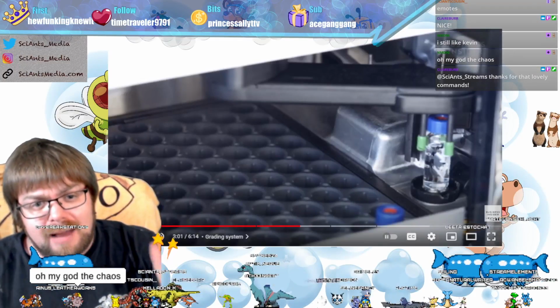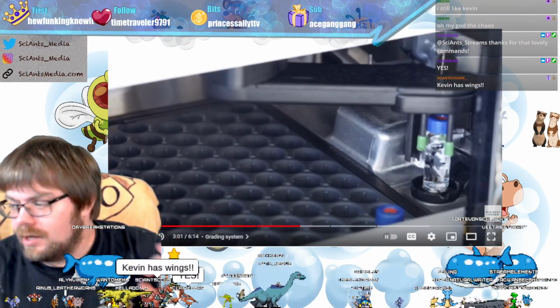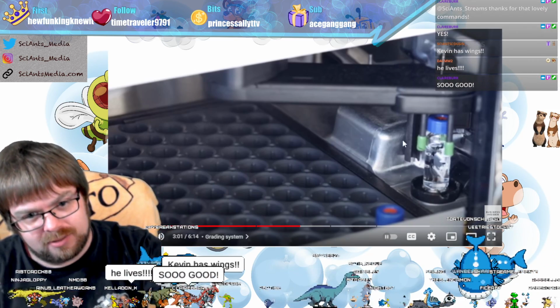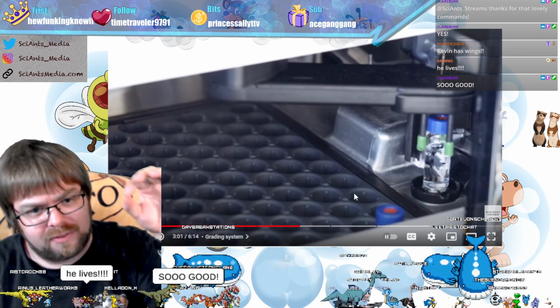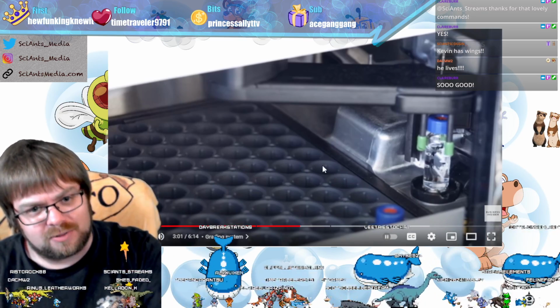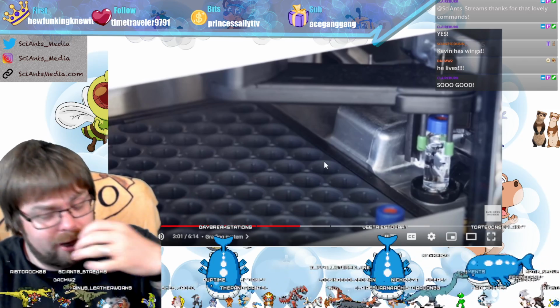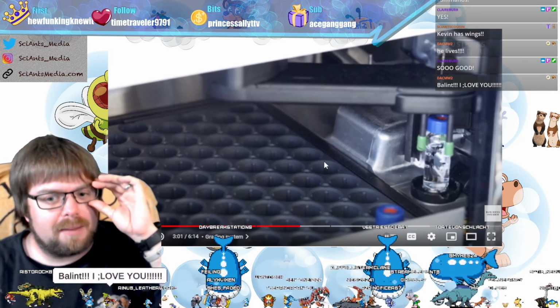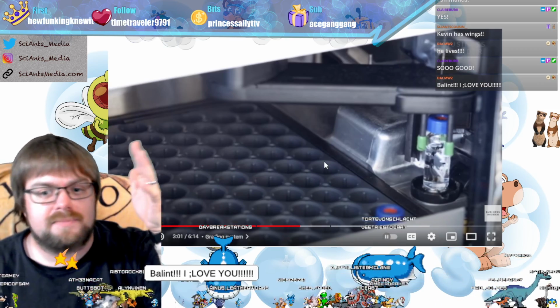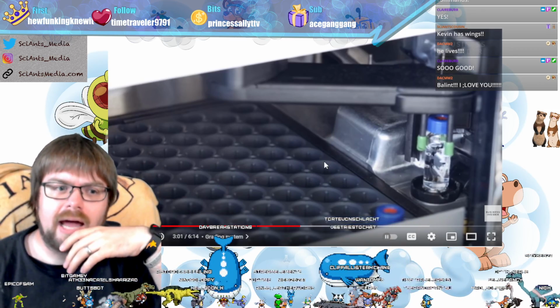Okay, so the mass spectrometer. The machine automatically moves the samples around. So you can actually tell the software, like, this particular well here has this sample in it, this one has this sample, this one has this sample, and then you load it and you walk away. Now, one sample could take an hour to run, and so you can tell it 10 hours or whatever.